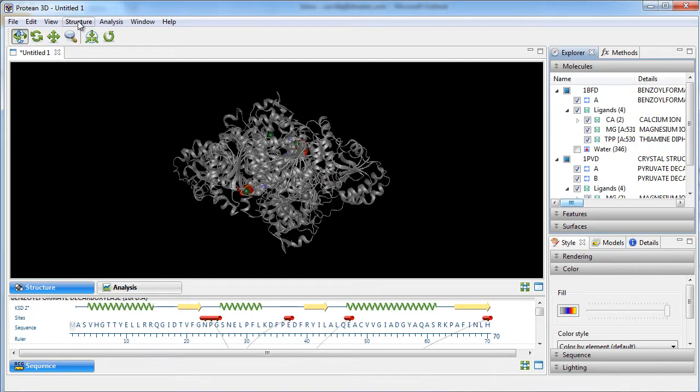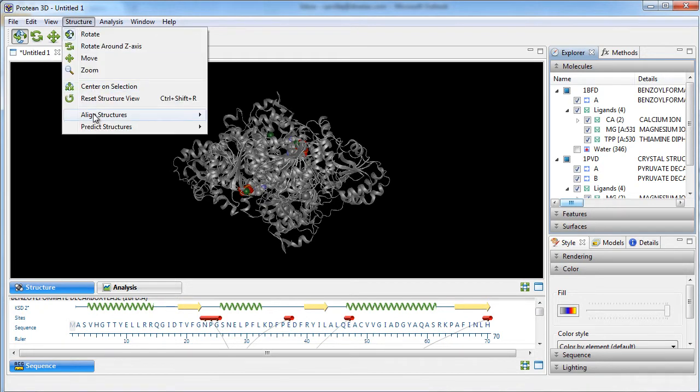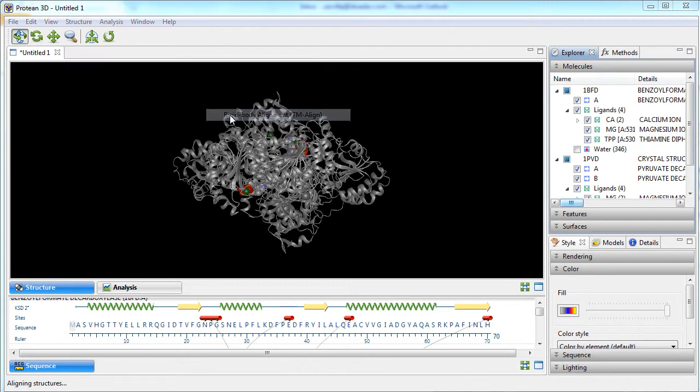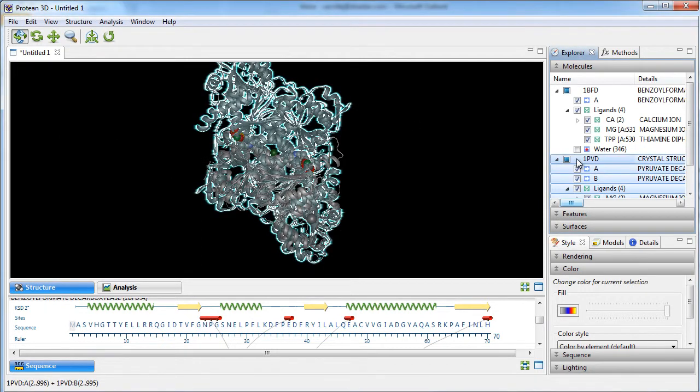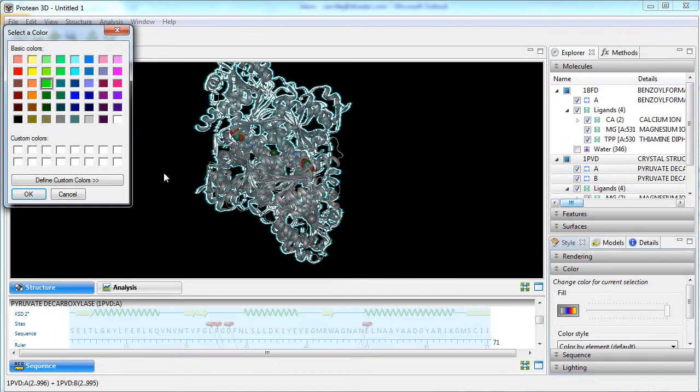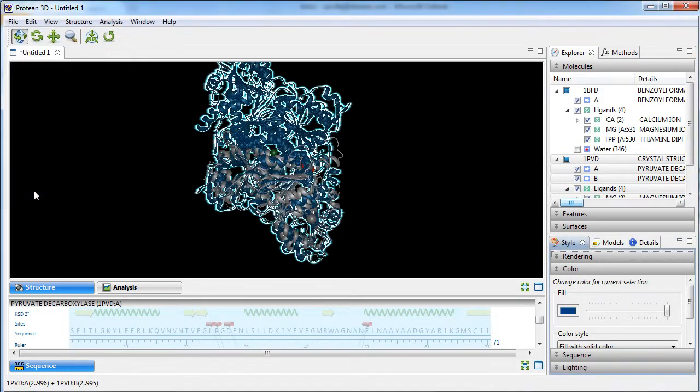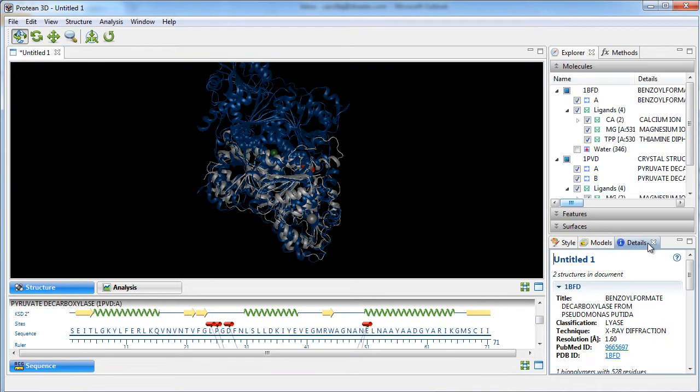You can also align multiple macromolecular structures to identify regions of similarity between two or more structures. You can take advantage of our styling tools for visualization purposes and view the RMSD values for aligned structures.